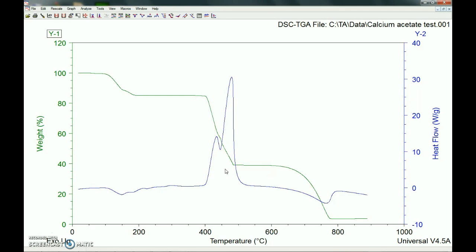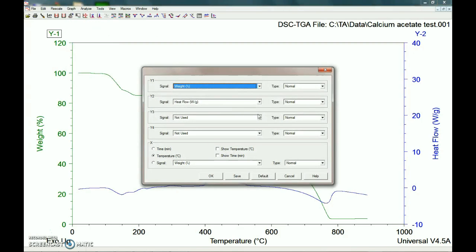We could look at heat flow like we were looking before. And that just tells us at 100 degrees here, we had some heat coming off. At 400, we've got a lot of heat coming off. And you can even kind of see from the heat flow two different sort of transitions here, these two peaks in blue. And then we had a little bit of heat flowing off towards 800 here.